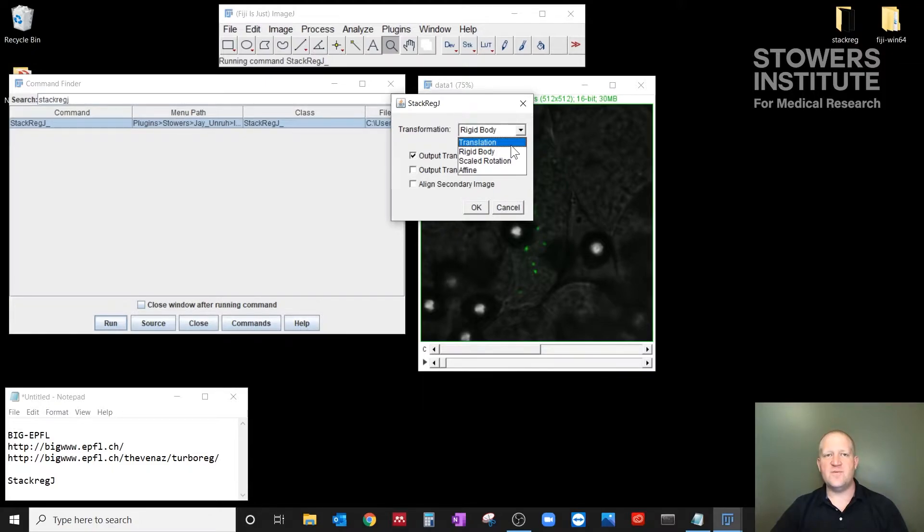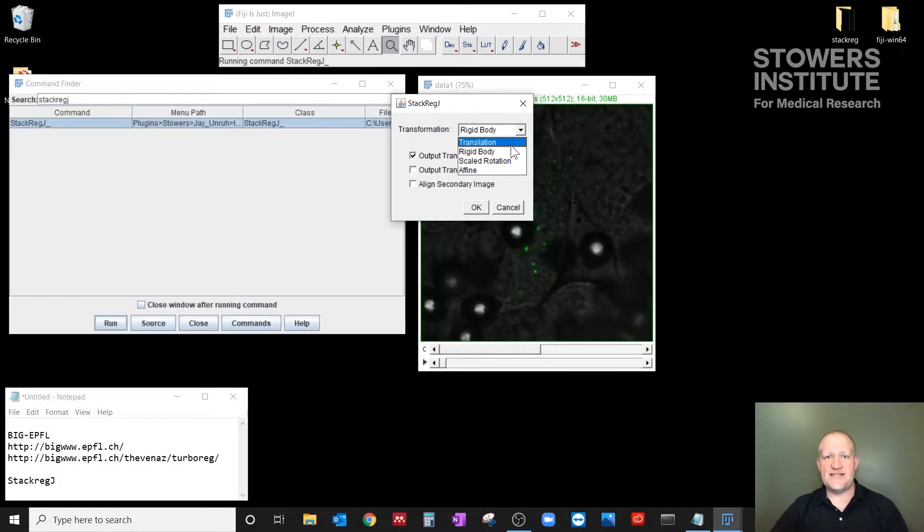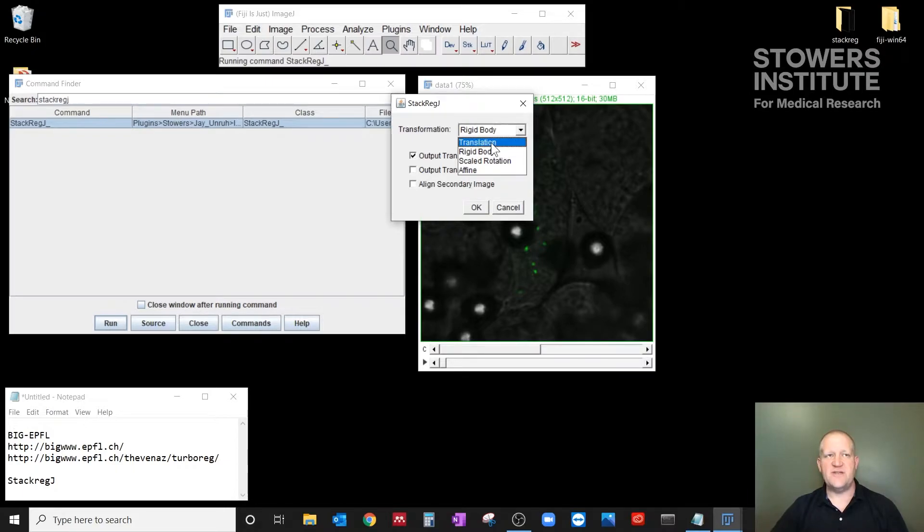So if you want to maintain image intensity and be certain of what the intensity is over time, I always stick with translation. And for most things, translation will work well as the registration method.